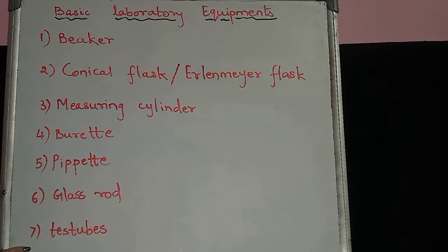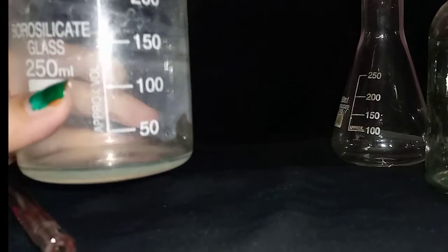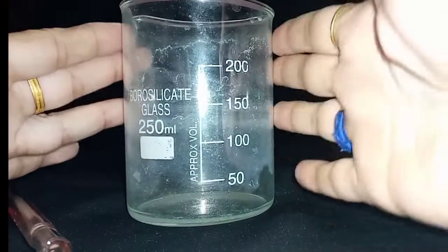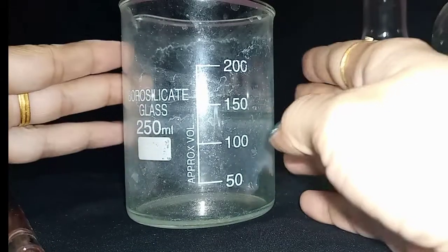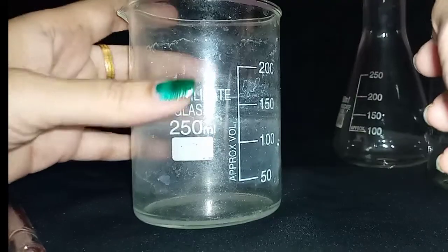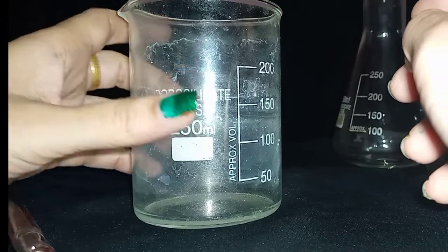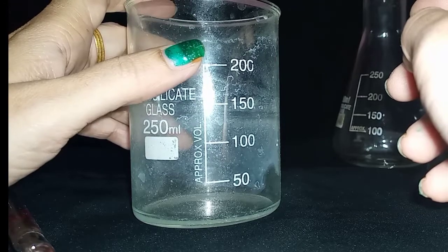The first one, here you can see, is a beaker. The beaker is made up of glass, it's parallel on two sides. It's made up of ordinary glass or borosilicate glass. Here you can see it's a measure of 250 milliliters, but we get beakers in the range of 100 ml as well as 50 ml.